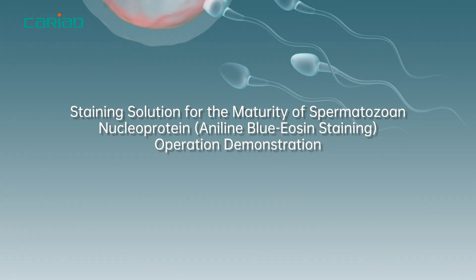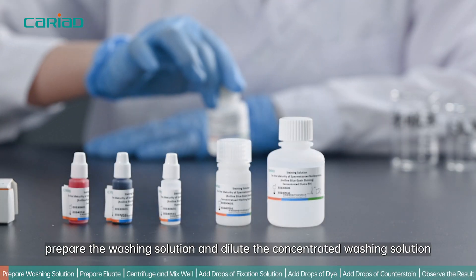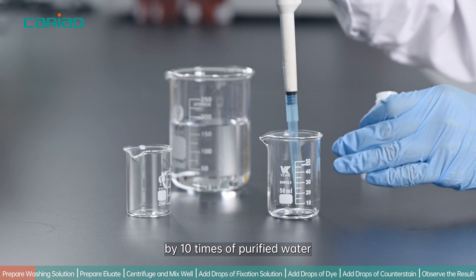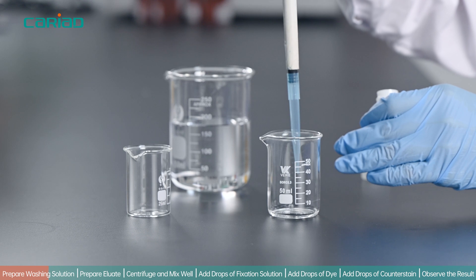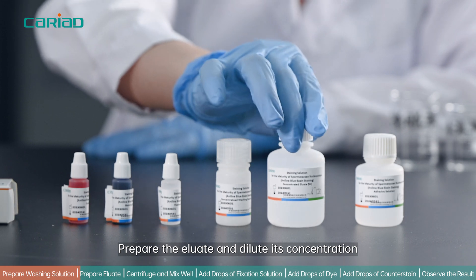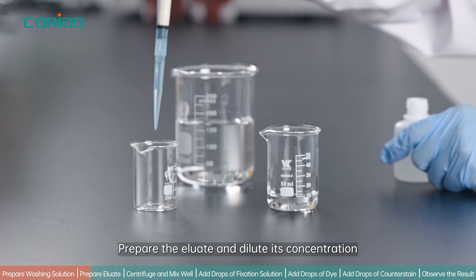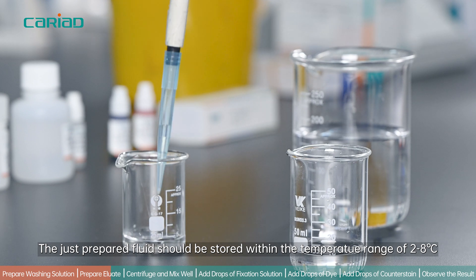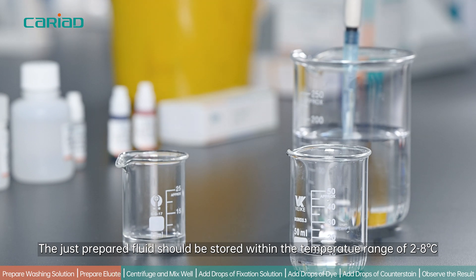Staining Solution for the Maturity of Spermidozoan Nucleoprotein — Aniline Blue Staining Operation Demonstration. Prepare the washing solution by diluting the concentrated washing solution 10 times with purified water. Prepare the eluate by diluting its concentration 5 times with purified water. The just-prepared fluids should be stored within the temperature range of 2 to 8 degrees Celsius.